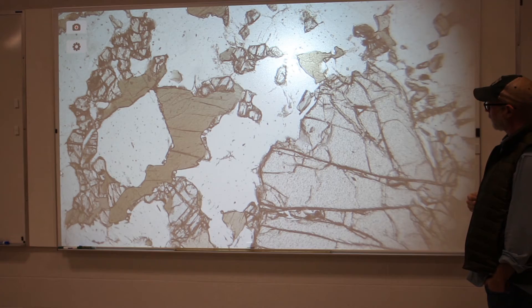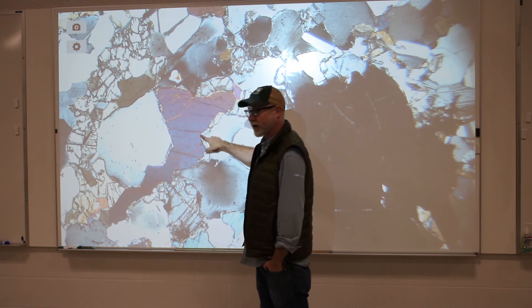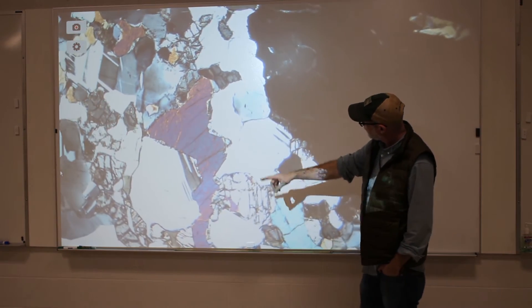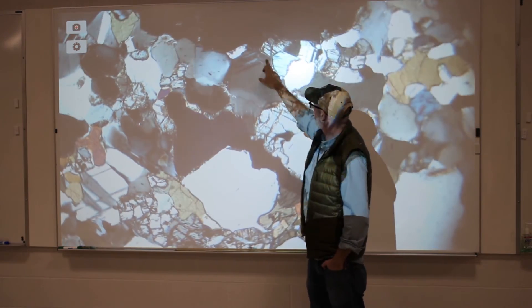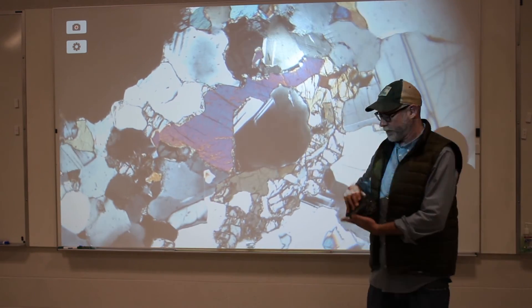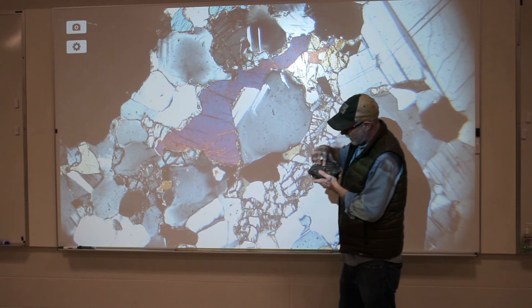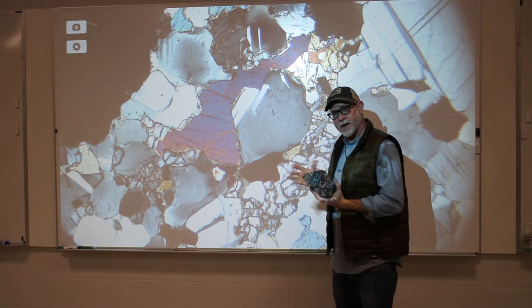Let's go ahead and cross the polars. If we cross the polars we'll see that the brown mineral shows quite vibrant colors. Our garnets go black, and as we rotate the stage you'll notice a couple of other features — the garnets remain black. A lot of our light-colored minerals show interesting patterns with stripes as you cross the polars and rotate the stage; that's our feldspar mineral. The garnets are here; the black and dark brown minerals are your colored minerals, and the white light-colored minerals are your plagioclase feldspars. So we can identify all these minerals in hand sample and in thin section.